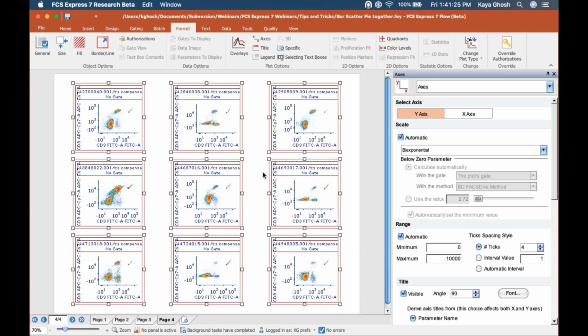So even in a given experiment, you're going to have a little bit of a different data range between files. And that's fine. You can just allow that to exist in your layout. But sometimes some people like to set the min and the max and everything to be uniform across their files, in terms of the min and the max of the plot, even though the range of the data is variant, okay? So there is a way to do that.